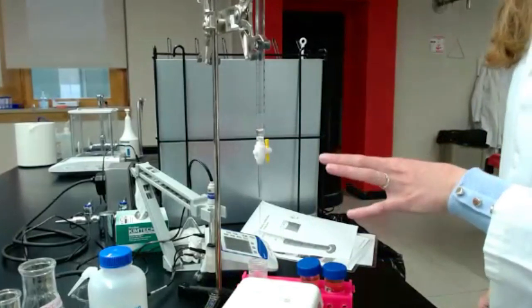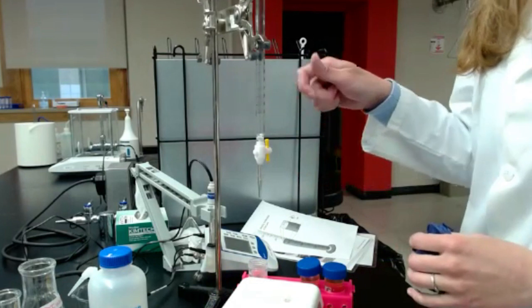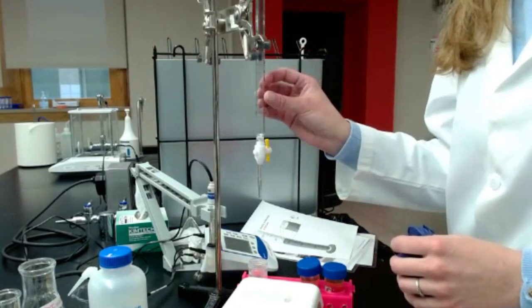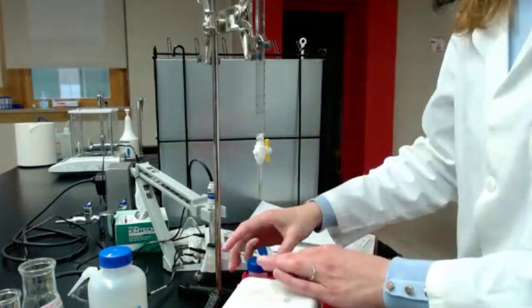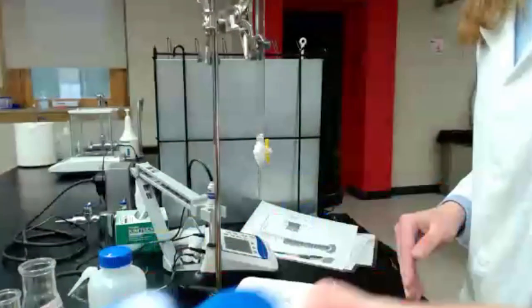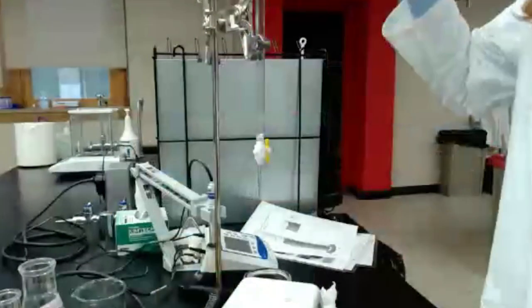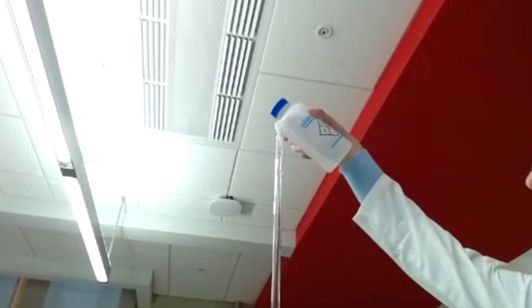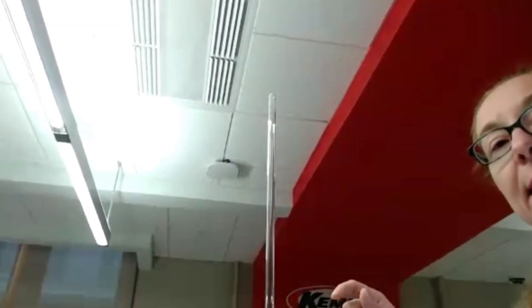One other thing is, once the burette is empty of sodium hydroxide, make sure you clean the whole burette with DI water. Once again, you don't want to have crystals being formed. So make sure you rinse. You use the burette and you rinse. And I should have kept my gloves, but. You keep having a beaker under and you clean with water. For me, that's easy because I have that fancy burette, fancy pipette. But make sure you do multiple rounds of cleaning.